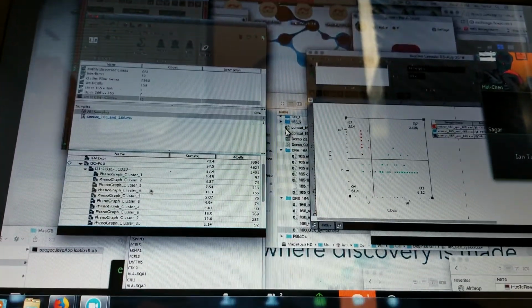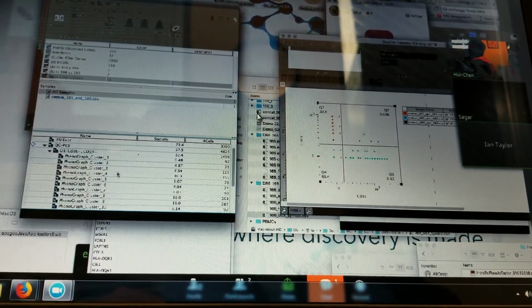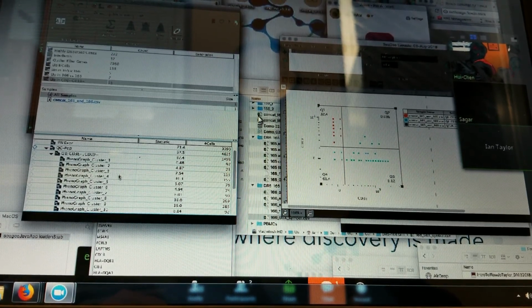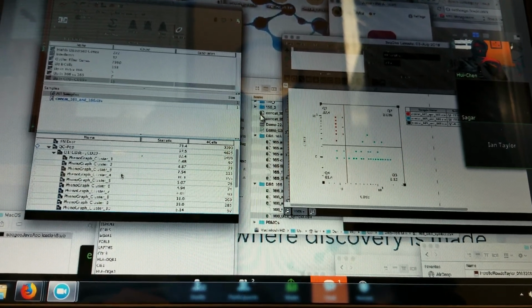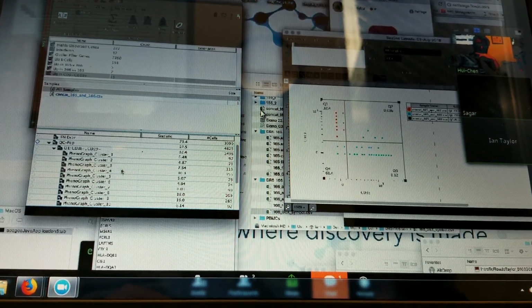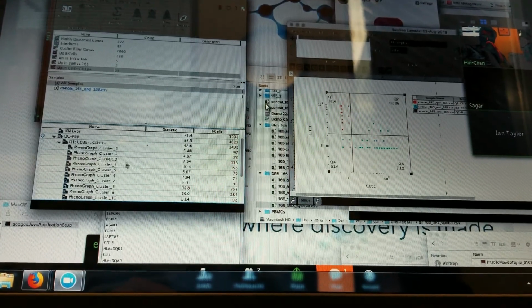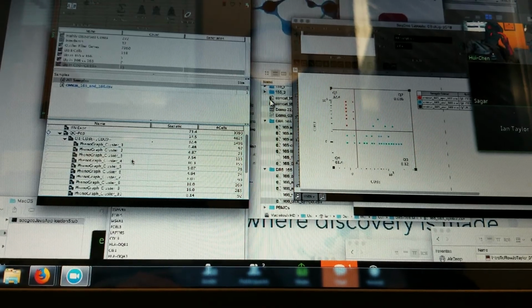So, t-SNE comes after doing principal component analysis typically. Right. The reason for doing the principal component analysis is to compress or condense the data matrix into something that's more amenable for these machine learning algorithms to work on. If we just fed those machine learning algorithms, like, for example, t-SNE, the raw data, we would get back a very strange looking set of clusters, and it probably wouldn't be useful information. So we first do principal component analysis and get everything down into a more condensed data matrix, as opposed to the sparse matrix from sequencing.